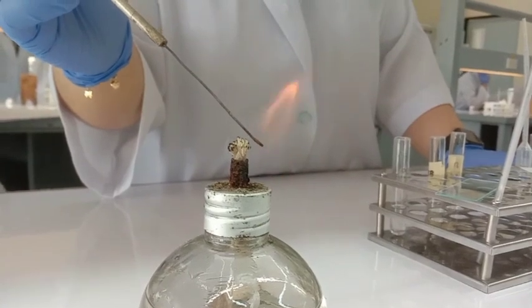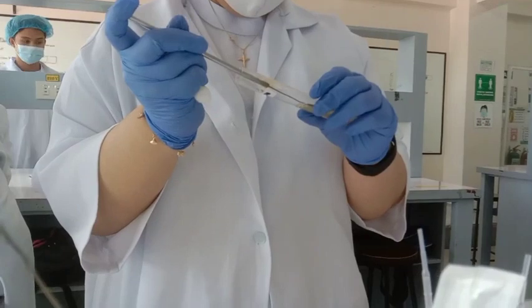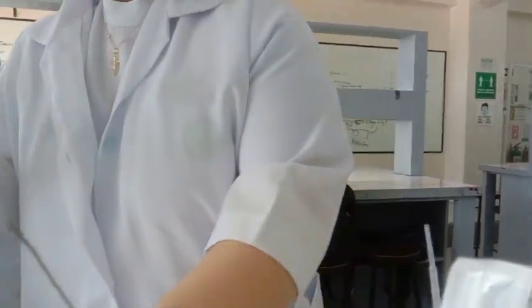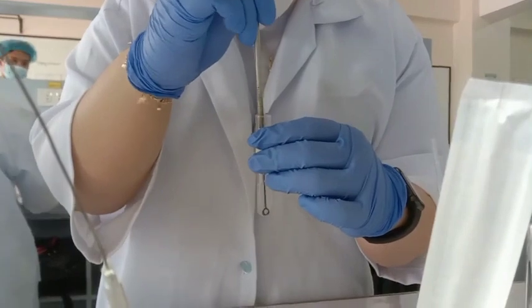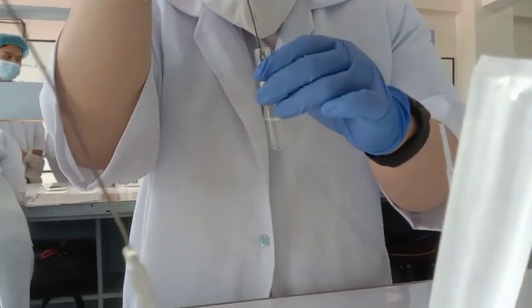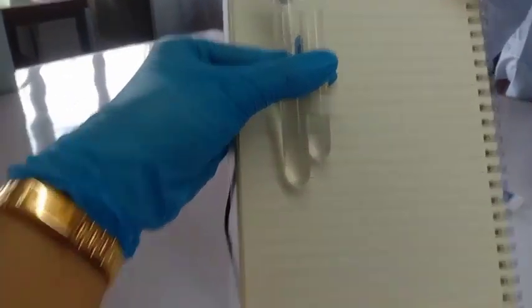To proceed with our test, we are going to prepare a broth for both organisms, Streptococcus and Staphylococcus, wherein we are going to inoculate these organisms into a broth and mix it well. Then we are going to compare it with a McFarland standard.